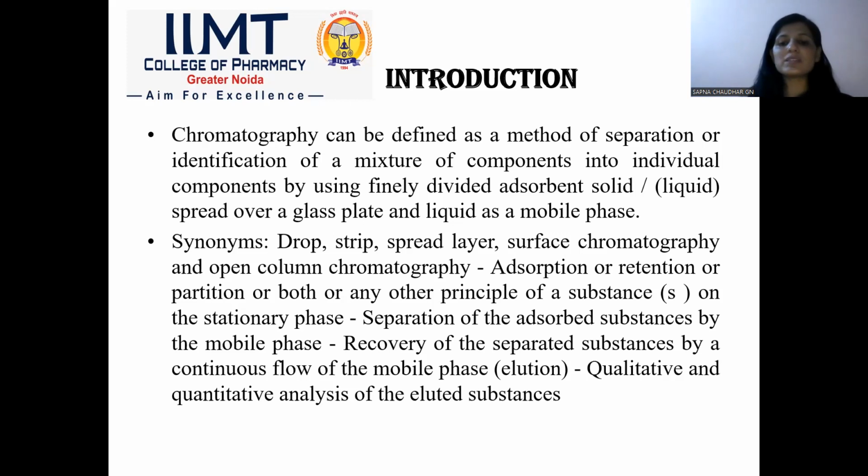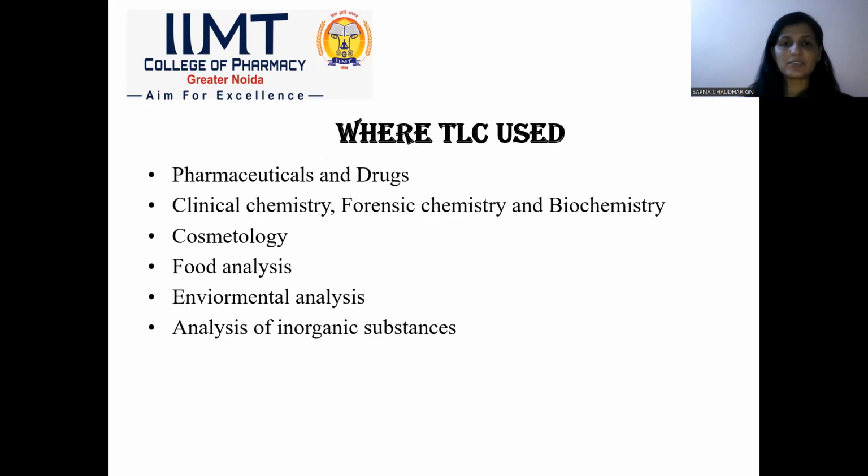The recovery of the separated compounds is done by the continuous flow of the mobile phase, and it allows qualitative and quantitative analysis of the eluted substances.